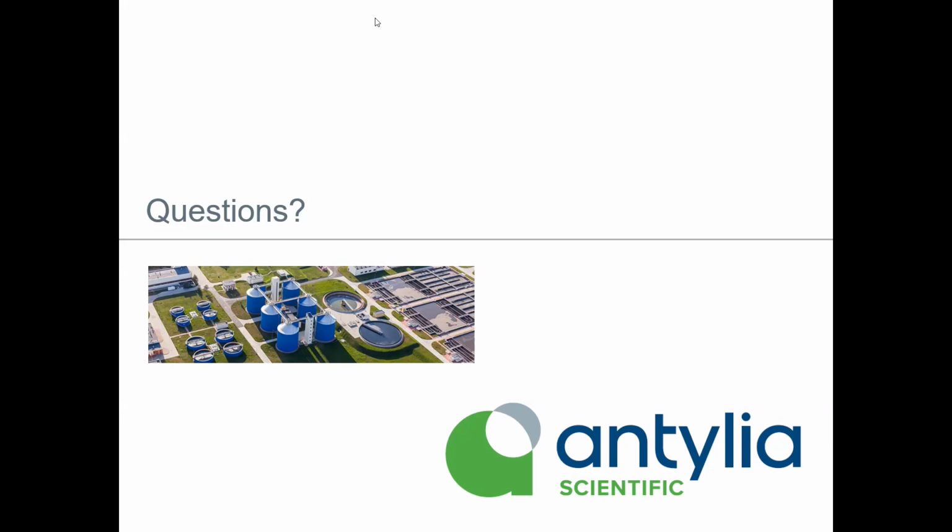Obviously, dissolved oxygen is one area. It used to be galvanic sensors and polarographic sensors were the number one sensor technology. Now it's transitioning to optical dissolved oxygen and BOD sensors. They're very fast, very stable, very repeatable. But as far as new technologies on the horizon, I'm not aware of that many.